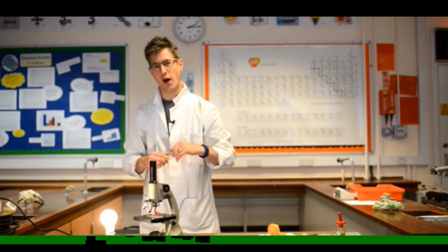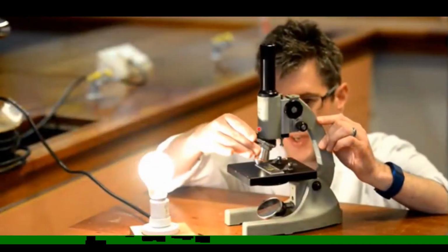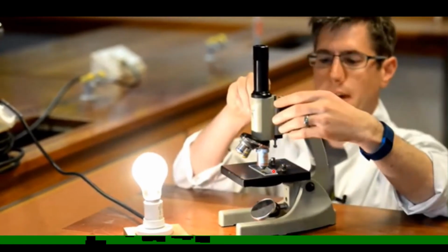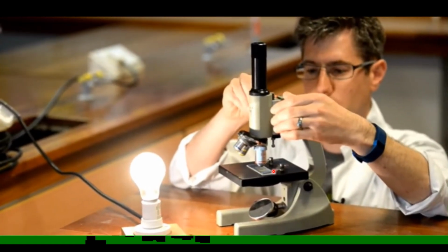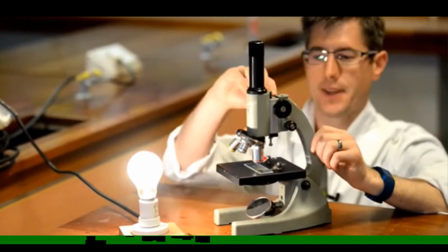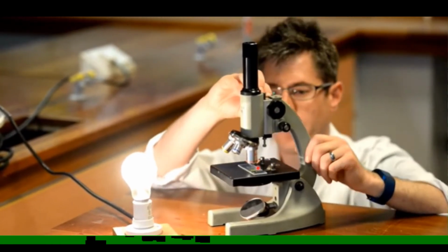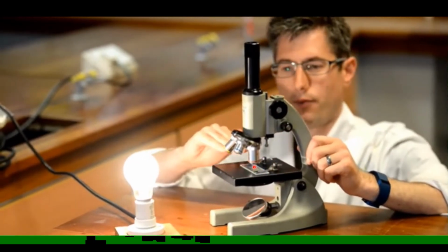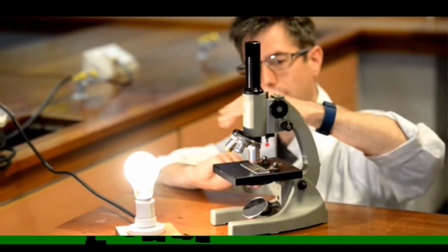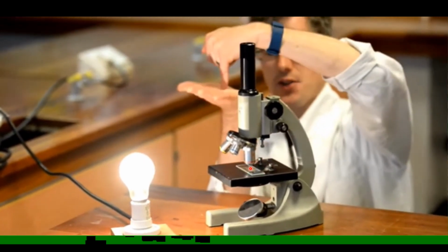So first you have to rotate the nose piece and bring the high power lens over the specimen so that you should be careful not to touch this lens on the specimen. මේ lens එකයි specimen එකයි එකට ගැටෙන්නේ නැති වෙන විදිහට high power lens එක අරගන්න අපි පරිස්සම් වෙන්න ඕනේ. එහෙම නිකමට හරි මේ දෙක වැදුනොත් එක්කෝ specimen එක damage වෙන්න පුළුවන්. එහෙම නැත්නම් lens එක damage වෙන්න පුළුවන්. එහෙම නැත්නම් මේ specimen එකේ තියෙන දේවල් lens එකේ ගෑවෙන්න පුළුවන්.